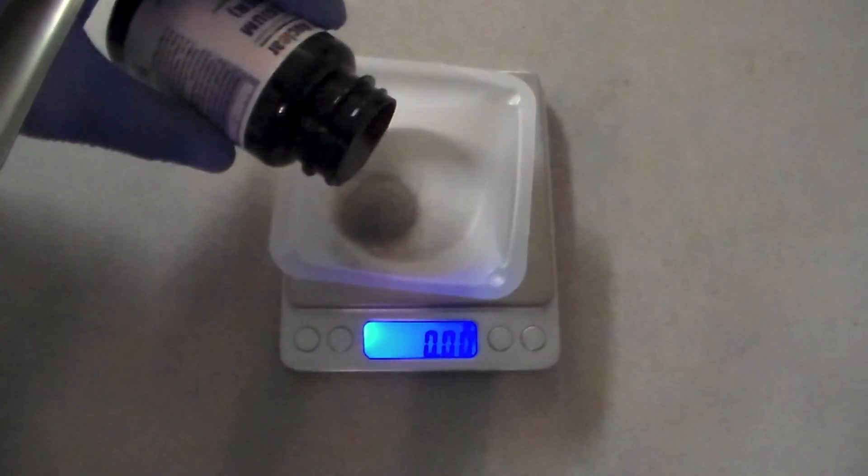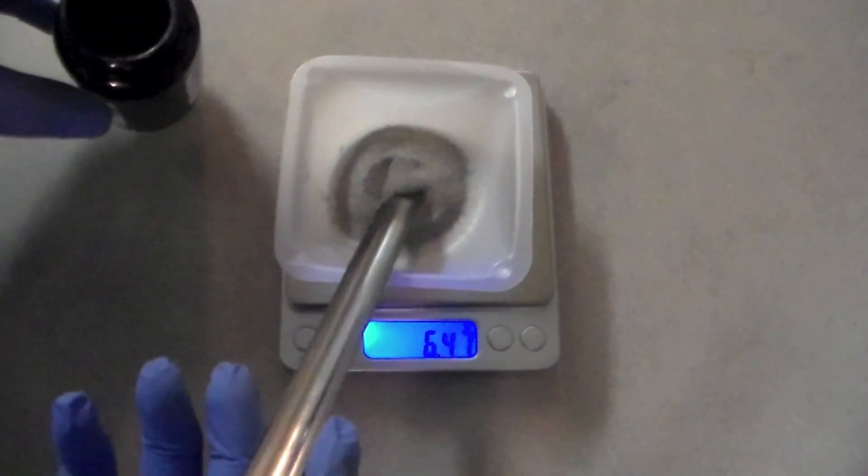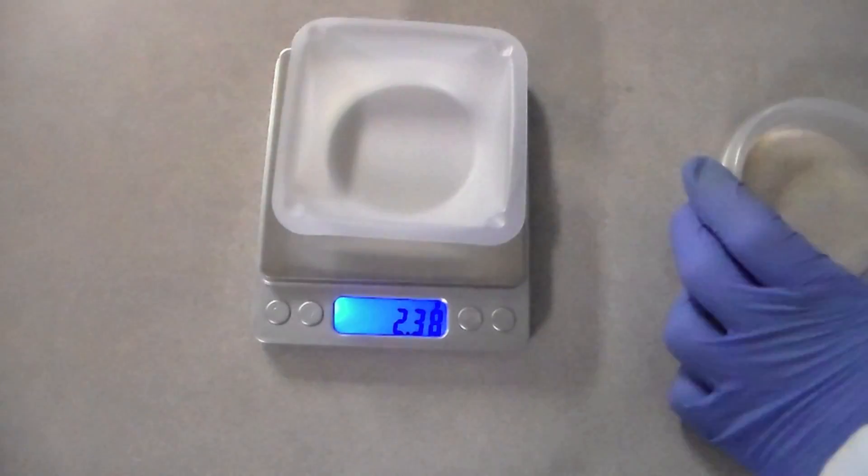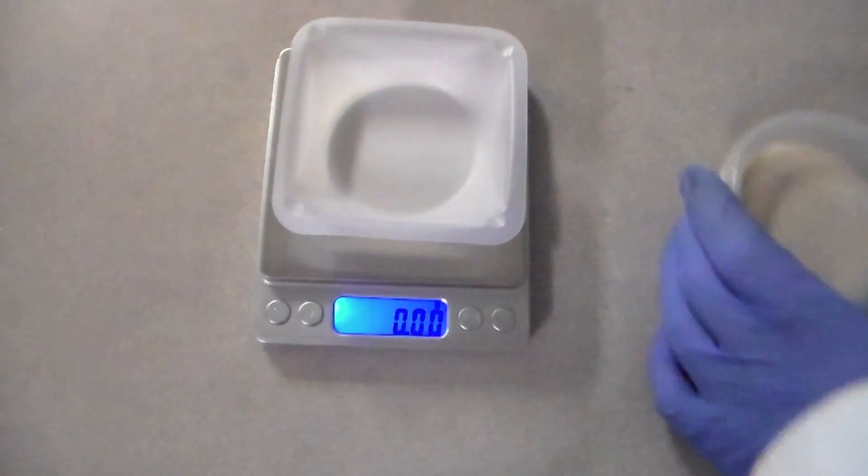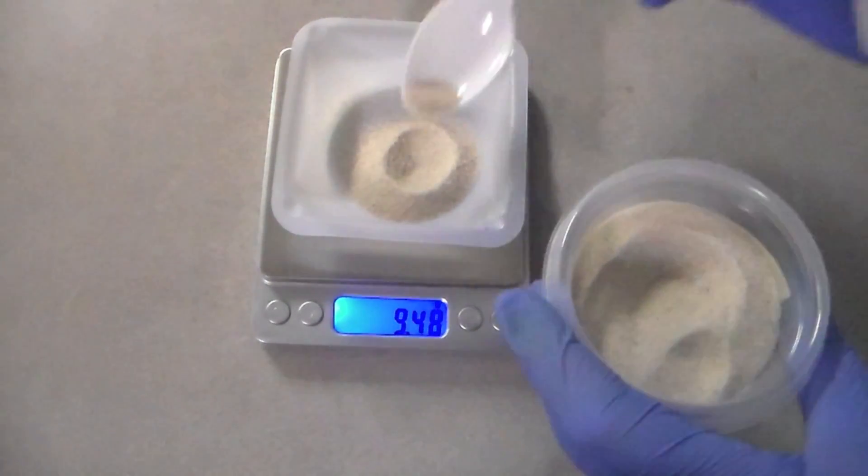When I weighed out the chemicals, you can see that I used a little too much magnesium, but I just redid the stoichiometry and found that I would need 9.53 grams of silicon dioxide to maintain the 20% excess.